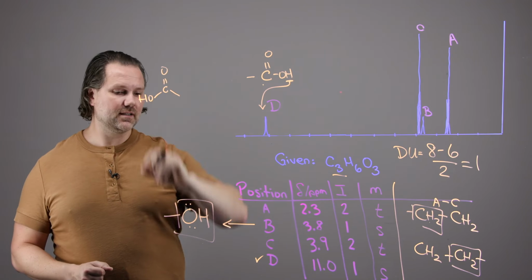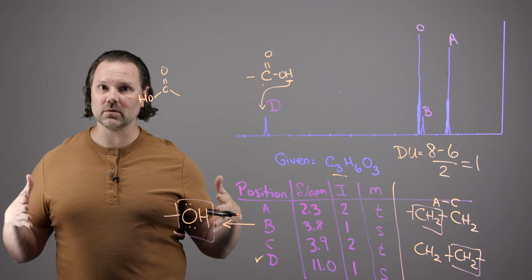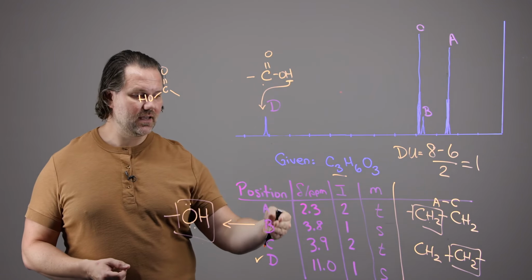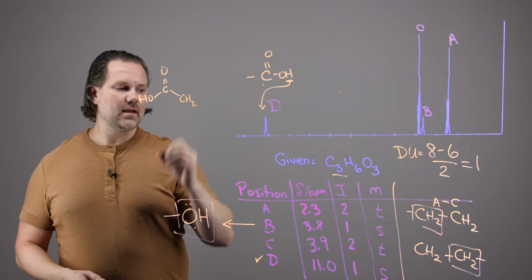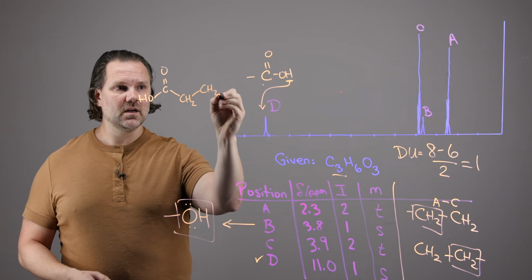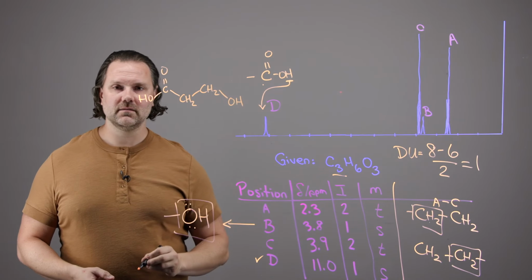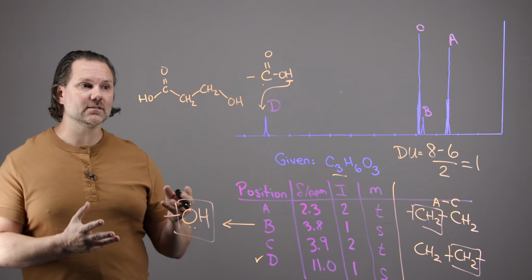We've got our carboxylic acid. If we attach that directly to the alcohol, that ends the molecule. There's only 1 bond permitted to that. So that can't go here. It must be either A or C, both of which are a CH2 group. And then whichever one it is bonded to a CH2 group, which is bonded to something else. The only thing left is the alcohol. And there we go. We've figured out what our unknown compound is.